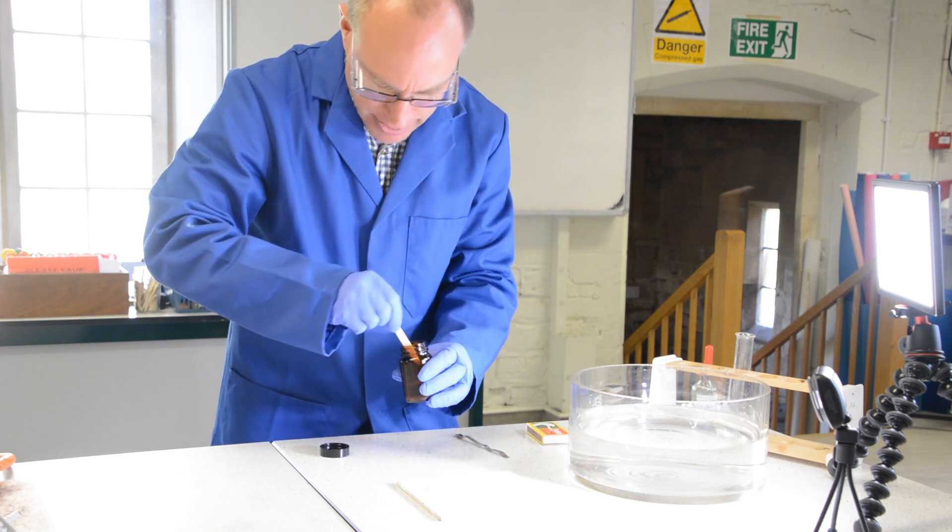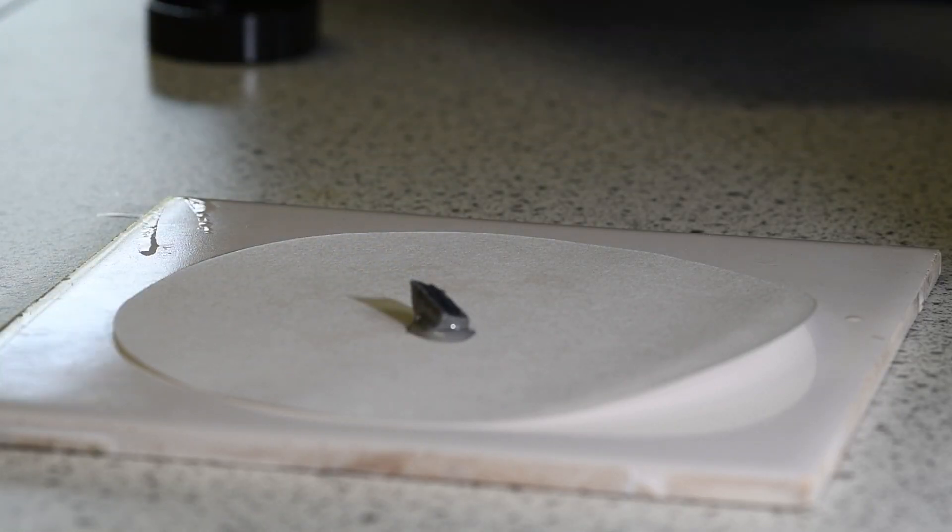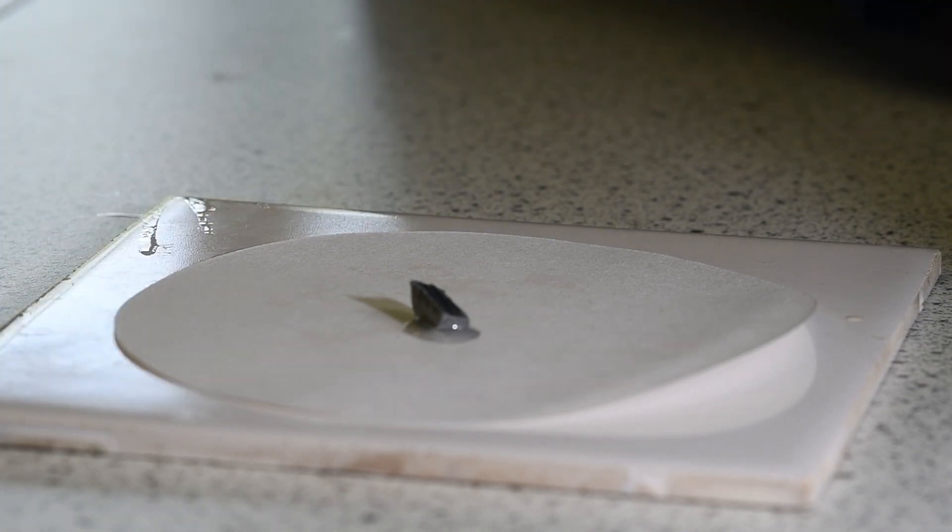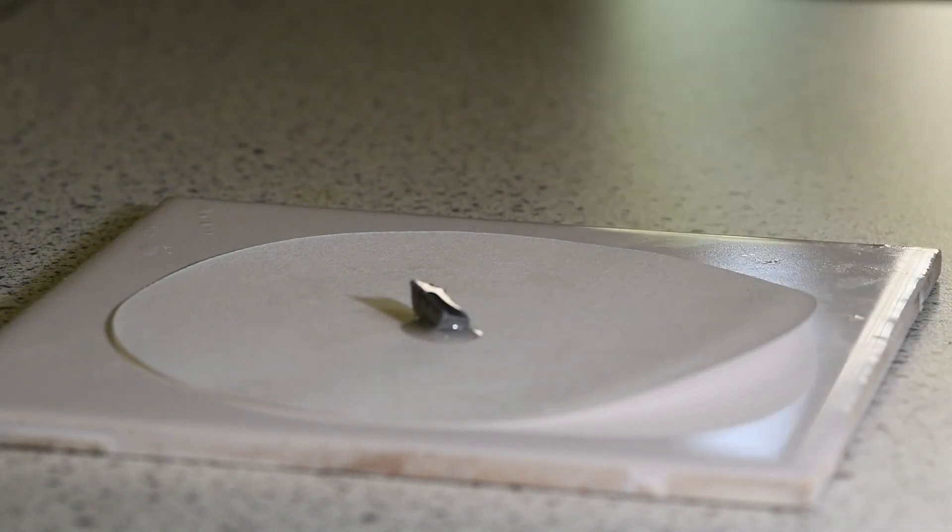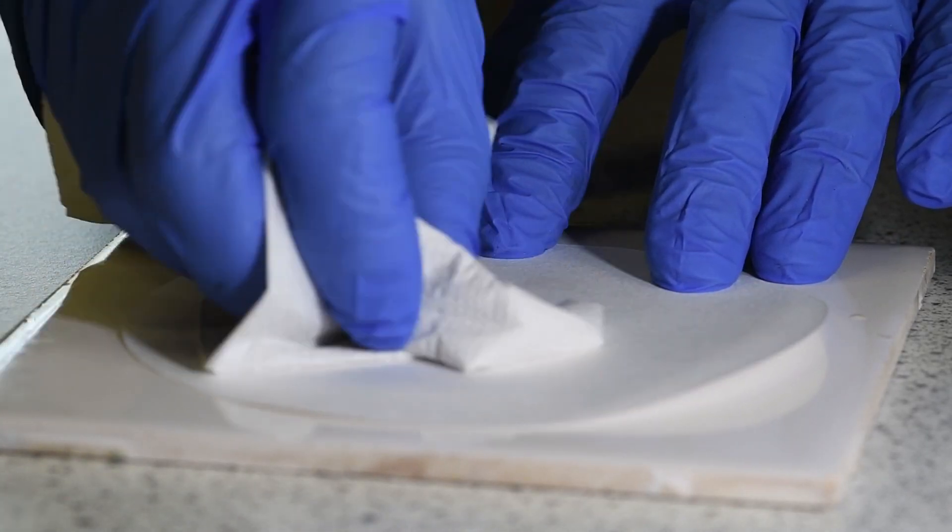So the first alkali metal we're going to look at is lithium. Notice that it's stored under oil because it's so reactive. I'm just going to dry some of that oil off the surface.